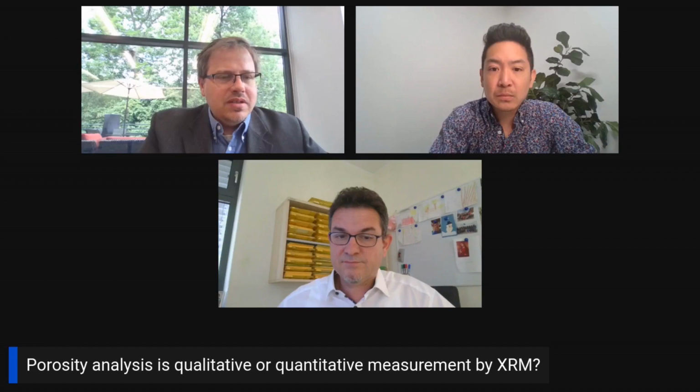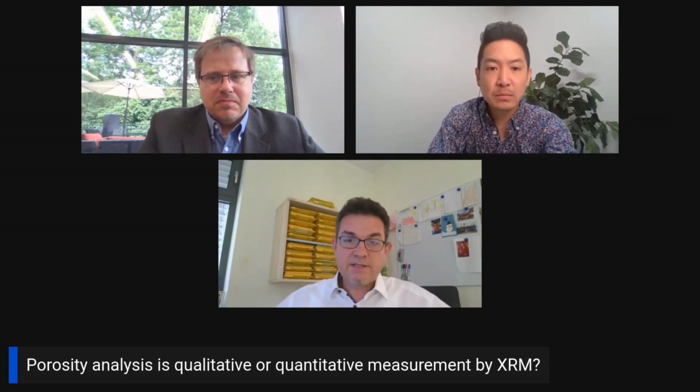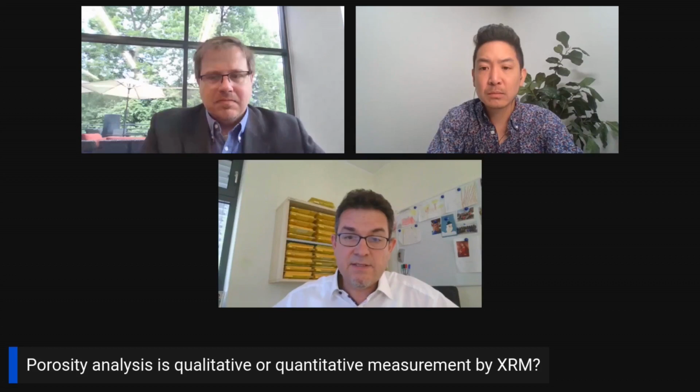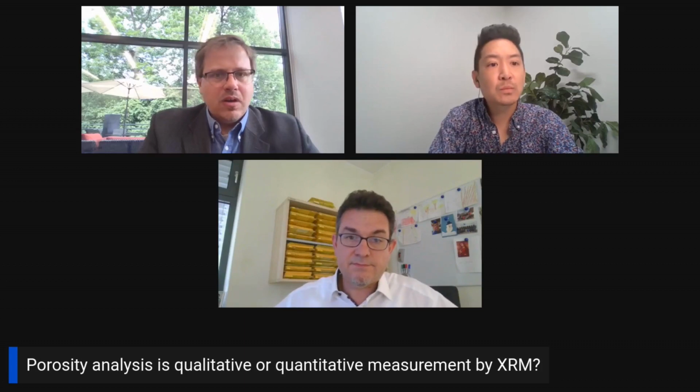Porosity analysis, is it qualitative or quantitative measurements by XRM? Yeah, both actually. Using the segmentation method, we can get precise volumes and size distributions. But some customers just look for large pores, which are like singular defects. That's more qualitative.